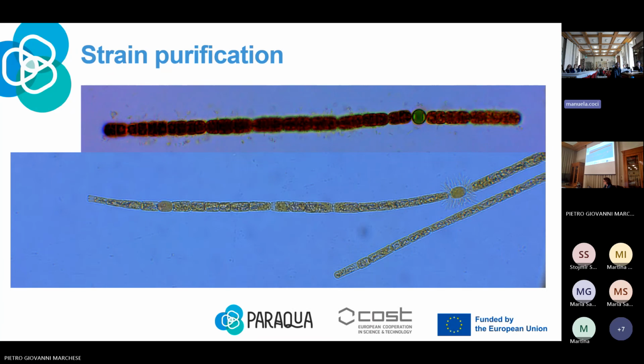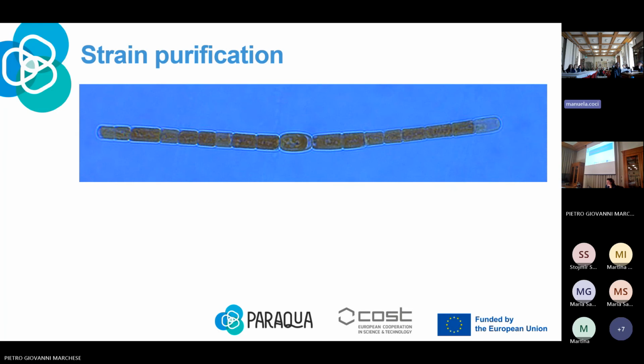Some cells, like heterocytes in some cyanobacteria, are very tasty for other microorganisms, which can make the process more and more difficult. So it's good to explore our fresh sample at the beginning to see the filaments that are free of attached organisms.